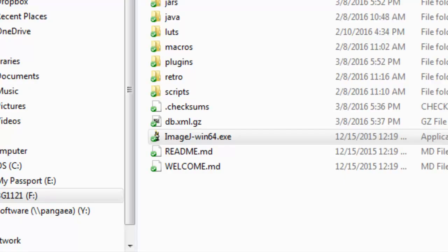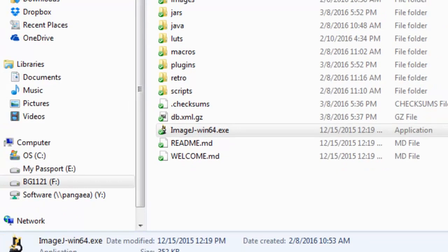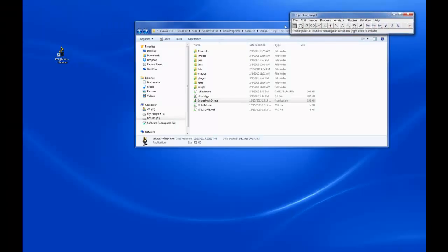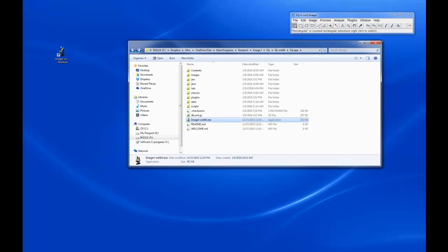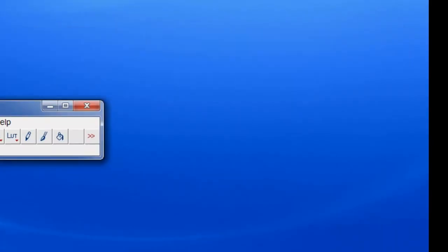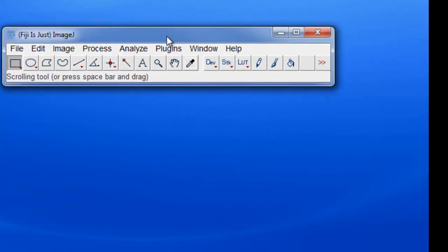It does take a second to start. Here is the program — it's a small interface but it does a lot.